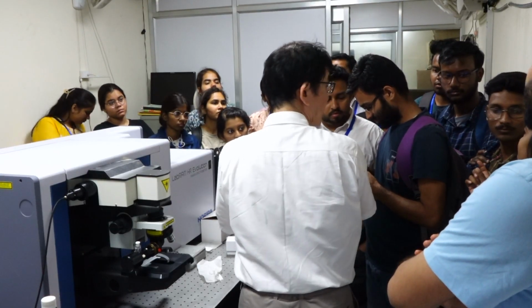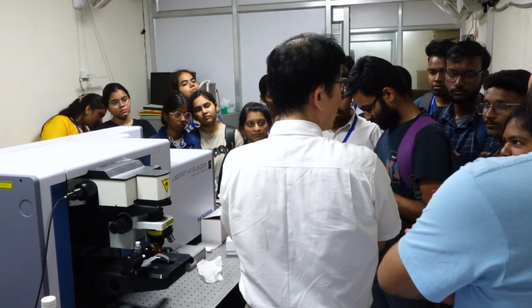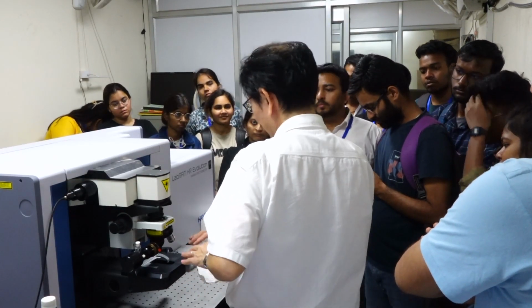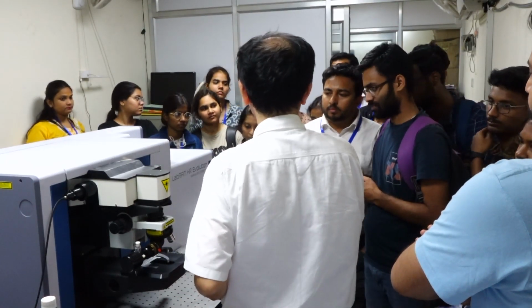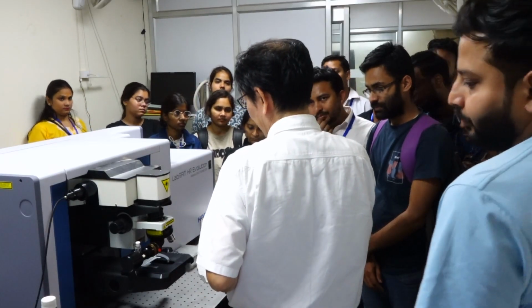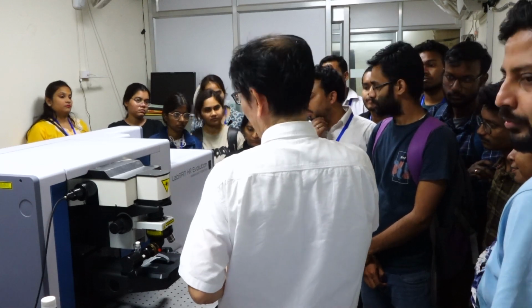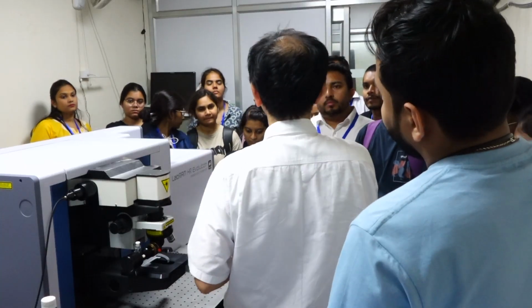Some types of nanoparticles, composite nanoparticles, silver-coated nanoparticles. Probably by adding some fabrication at the sample point, additional experiments would be possible. But at present, it may not be possible. It depends, so the instruments should be customized for your purpose.